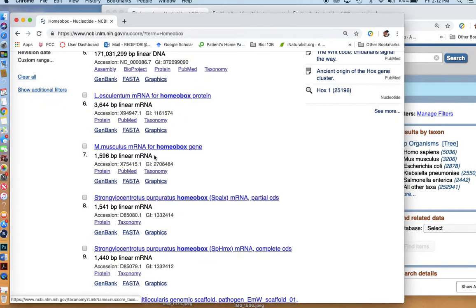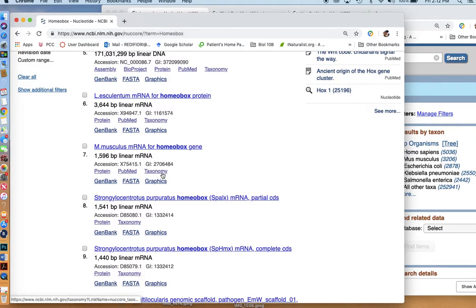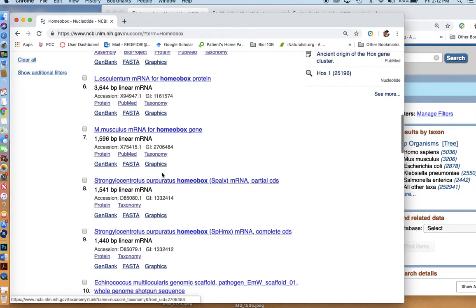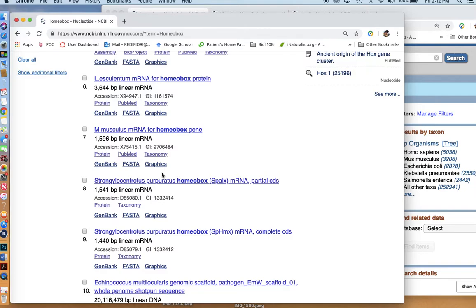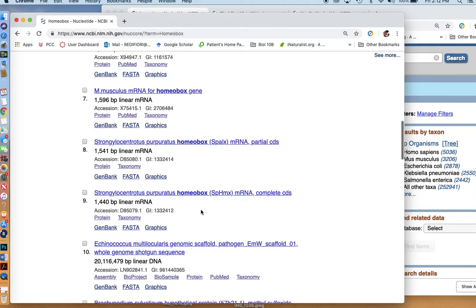So what we want are some smaller bits. Here's a mouse gene with 1,500 base pairs, and that's kind of interesting. Although mice are pretty high in the phylogeny of animals, it's pretty far along at the upper end of the chordate part. And if we want to explore the origins of animals, we want to look at something a little more close to the base of the phylogenetic tree.